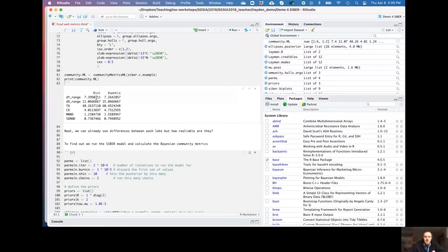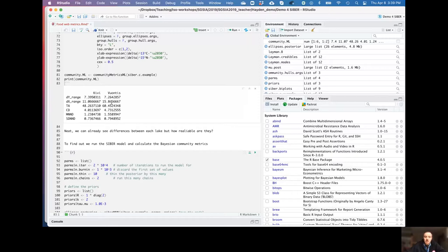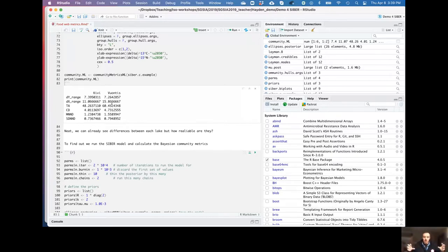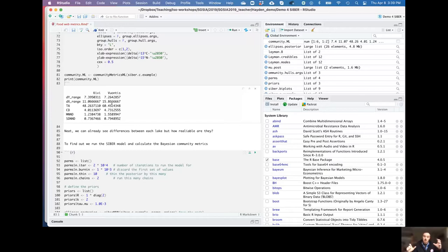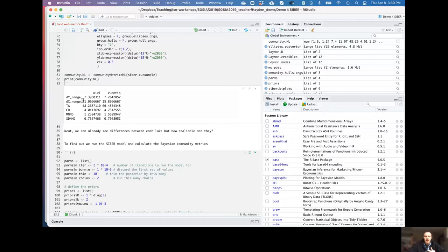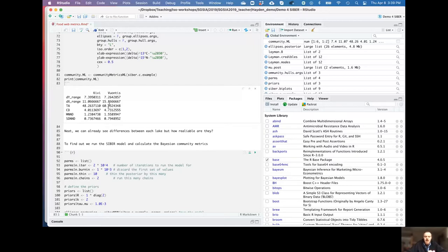So straight away here, very quick and very easy. We've got these single values for dY range, dX range. So here, essentially, this is our nitrogen range on the Y axis, X range is the carbon axis or carbon range, total area, distance to centroid, mean nearest neighbor distance and standard deviation of nearest neighbor distance. And we talked about what these reflect and represent in the class. But first things to look at, food chain length in both systems seems to be pretty equivalent. Carbon range, quite a bit bigger in Lake Vauntas. Remember Lake Vauntas, it's the larger lake with more littoral, more pelagic production.